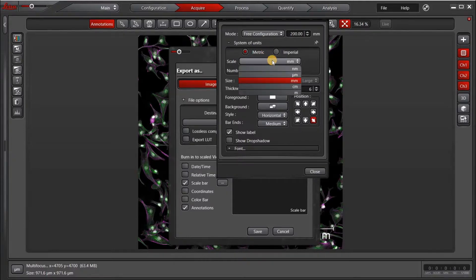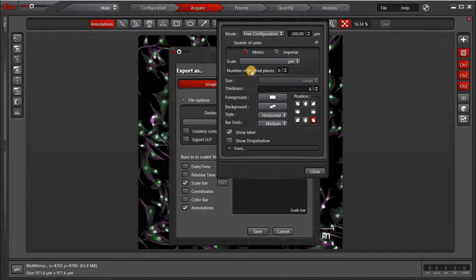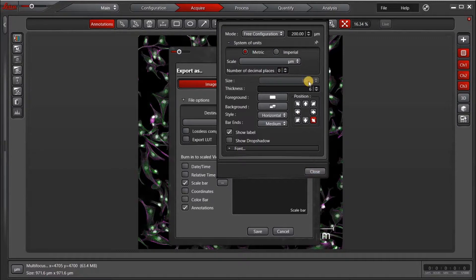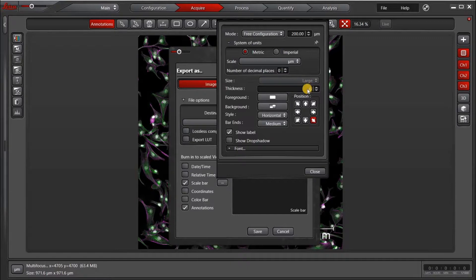So, for instance, I'm going to choose 200 microns so that we can have the same units on both scale bars. I can choose the thickness of the line. I can choose the position of the scale bar. So I'm going to put this one in the left-hand corner.